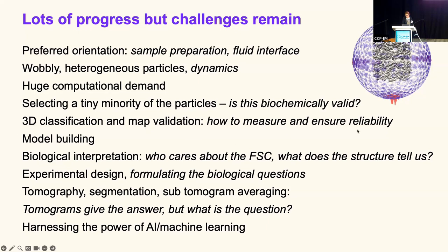I think 3D classification is still not that straightforward. So the 2D classification, you can make this graph, from the original MSA, but 3D is more complicated because there's projections and the classification to sort out the conformational variations. So these things are still not that straightforward. Model building seems to be getting very good if you have decent resolution, which often we don't.